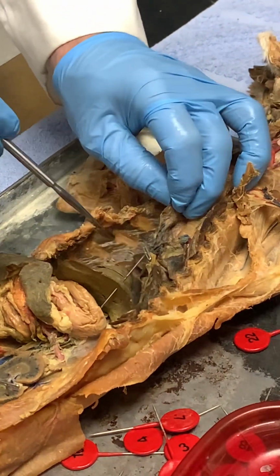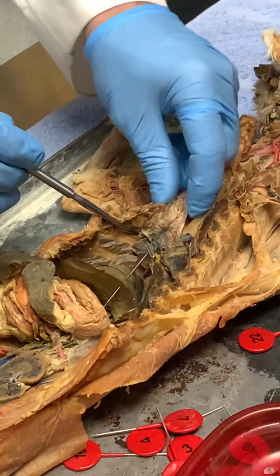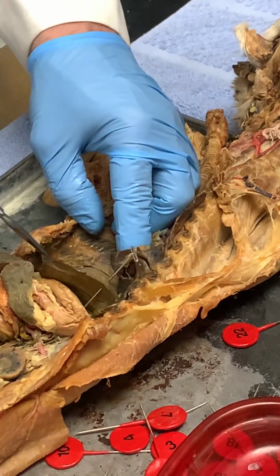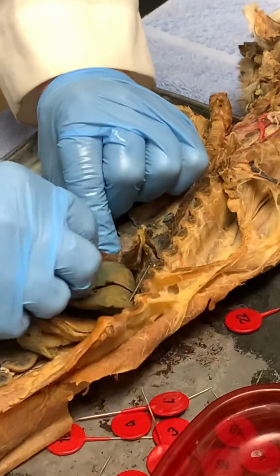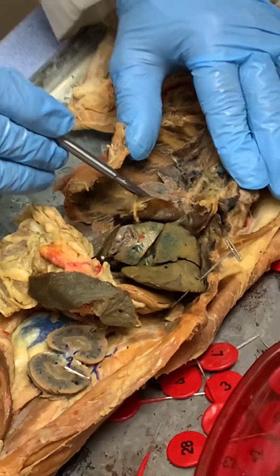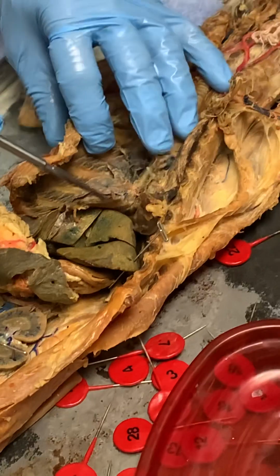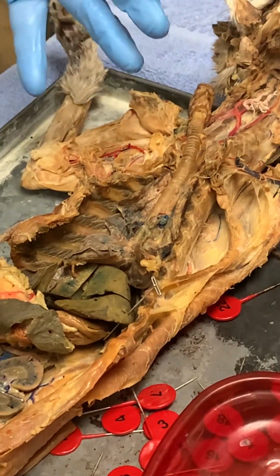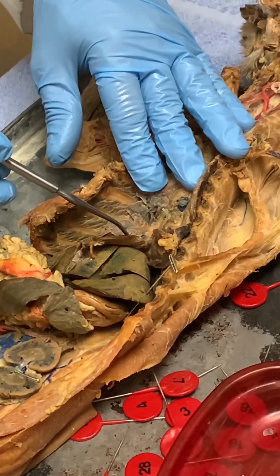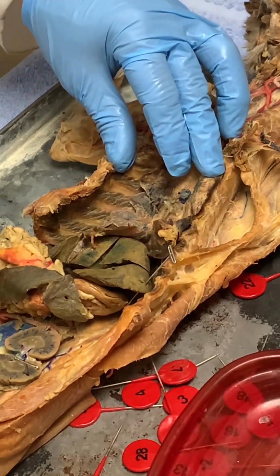On the right side, you have one extra one, just like in a human, but you added one on both sides. So this would be the anterior, this is the middle, this is the caudal, right here. And then right in the middle, that's the accessory lobe. Okay? And it looks like it's right in the middle, but it's attached. You can see the vein here going to the right, so that's why they call that part of the right lung.